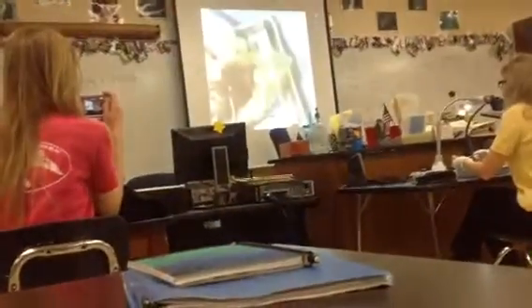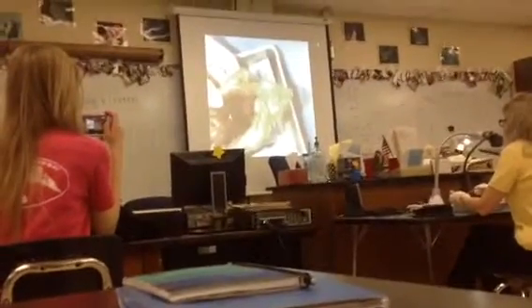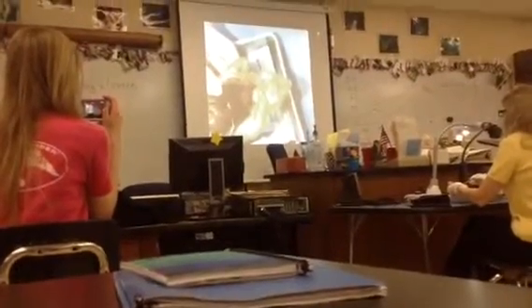Those are going to be the ventricles. Remember that you're looking at the rat, so right and left are reversed. So this side over here is going to be the right ventricle. Over here is going to be the left ventricle.